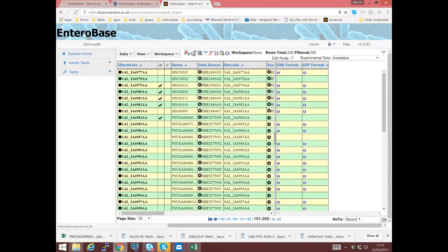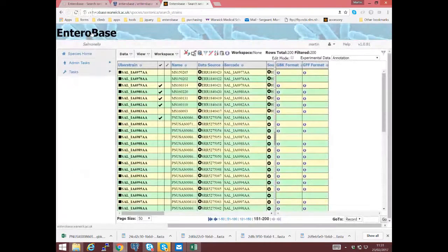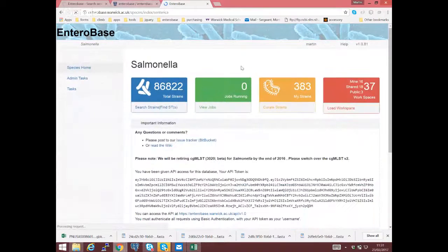We have another question. What kind of de novo assembly is performed? The assemblies that we're talking about, that are used to drive all of the subsequent analysis, we use SPAdes. We have our own quality control pre and post assembly to make sure there aren't any scaffolding errors or anything like that. But essentially it's a SPAdes assembly.